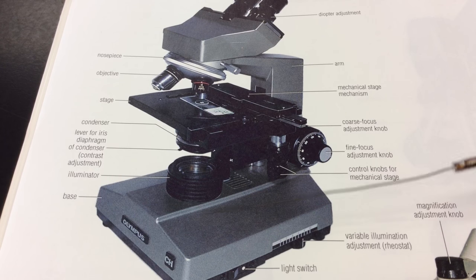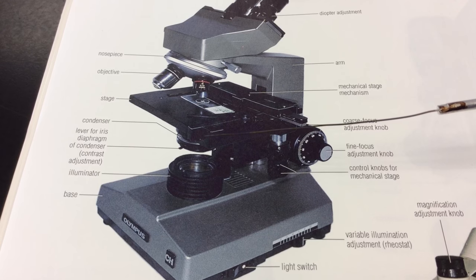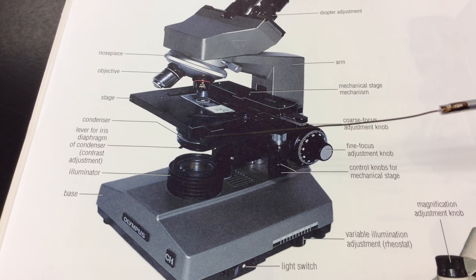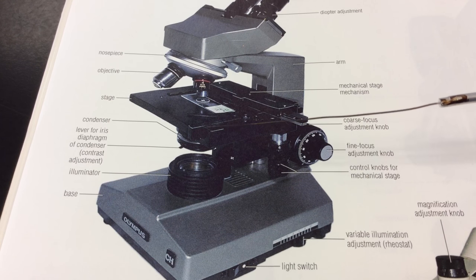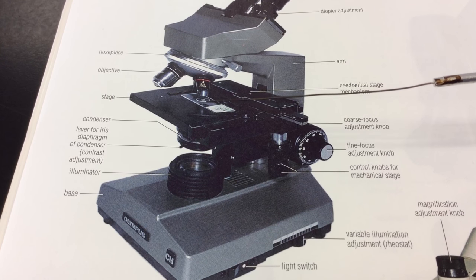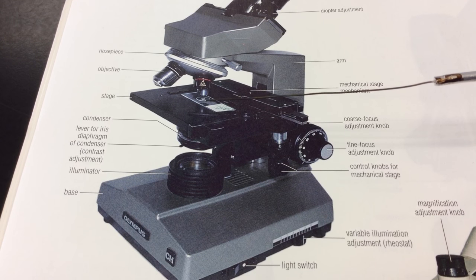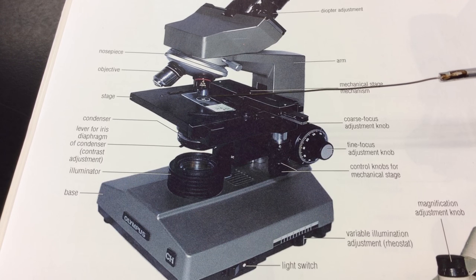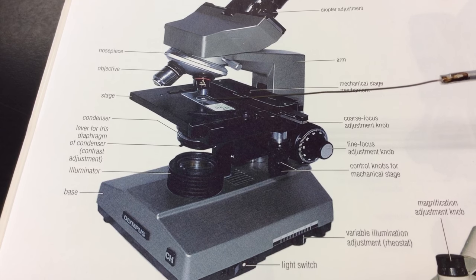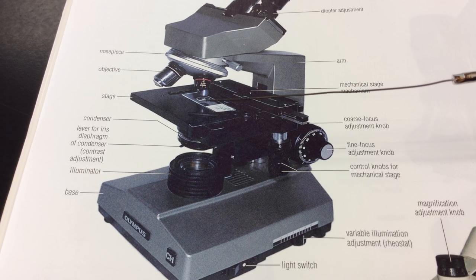to flow from the base, where we have a light bulb in the base. It's going to flow up through a series of lenses, a substage condenser. And the light then will be focused by the substage condenser on your specimen, on your microscope slide. So we always want to make sure that our specimen, our microbes of interest on our microscope slide, is centered over the hole where the light's going to hit the specimen here.